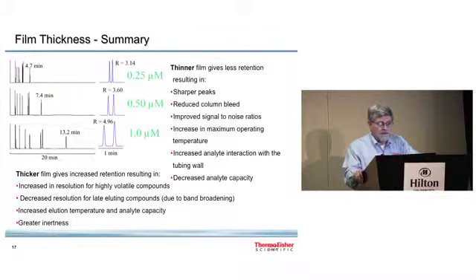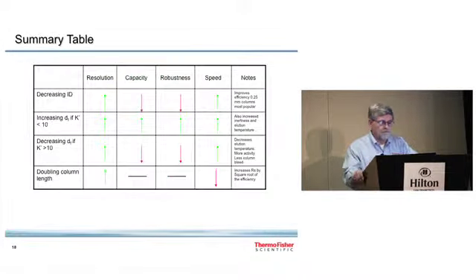Thicker film gives increased resolution for your lighter compounds. Worse resolution for your late eluting compounds. It gives you better elution temperature, better analyte capacity, and better inertness. Here's a table summarizing this.